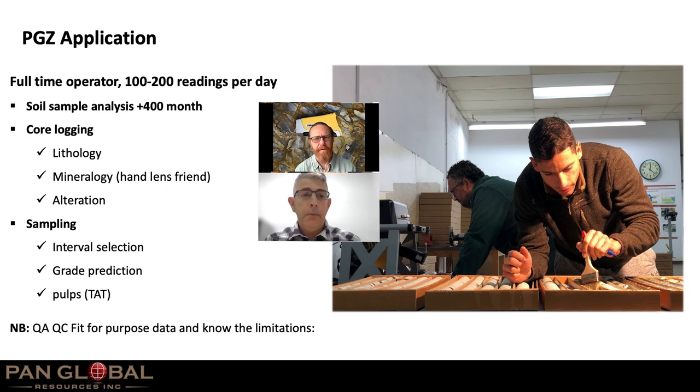Yeah. Oh no, I was just going to say you are really lucky to have that sample prep facility and be able to get the pulps back so quickly. Well in advance of the lab data. That's right. Best case scenario, really, for you. It really is. And I think as well, if I was working in a remote area, there would be a strong case to say, well, let's install a containerized lab. Or do some sort of sample prep, yeah. Exactly. So important. We're 3 weeks ahead of the game.